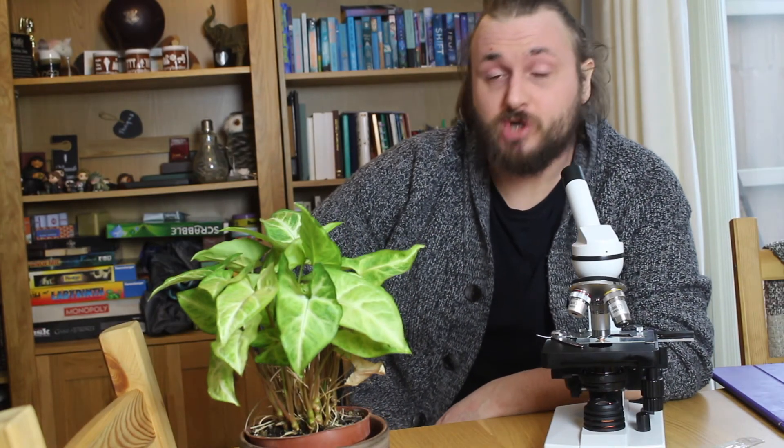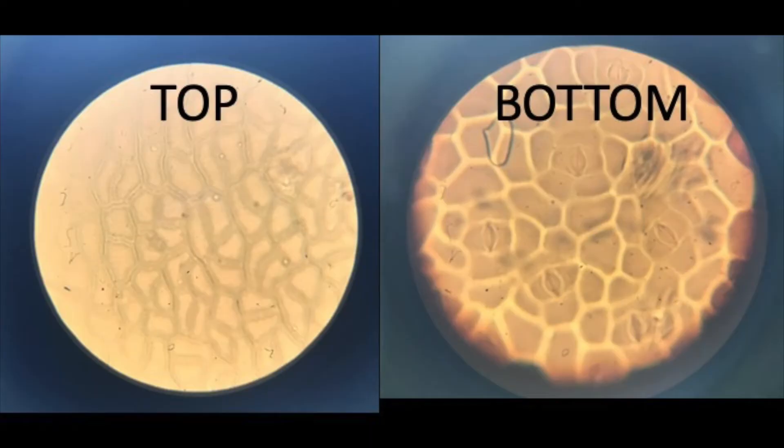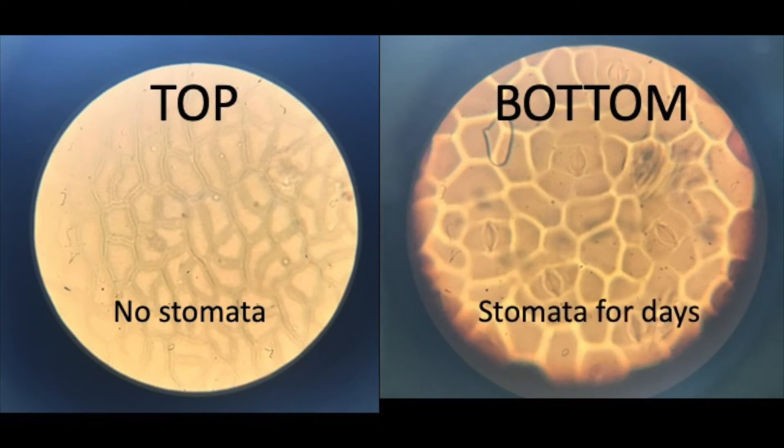From the top of the leaf you can see that there are no stomata at all — just the patterning of the epithelial cells. But from the bottom of the leaf we can see loads of stomata, which of course allow the leaf to perform gas and water exchange.